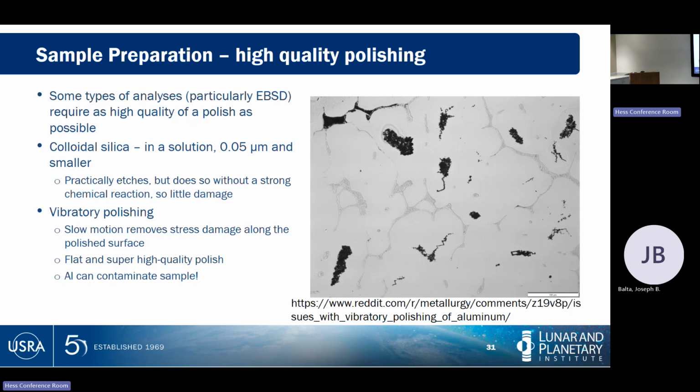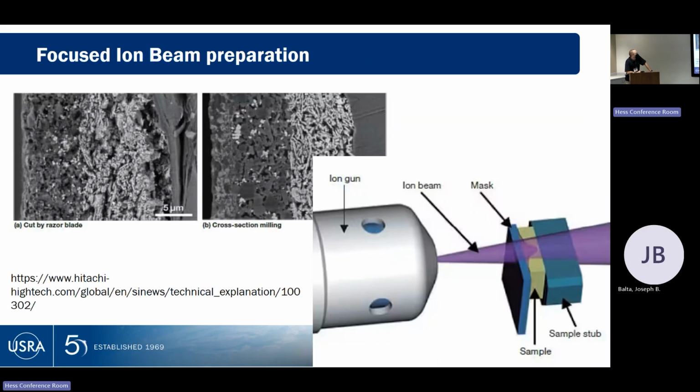It's nice, it's super high quality, but it's also super fine stuff. If you're immersing this sample in superfine silica or superfine aluminum, you're going to get some superfine silica or superfine aluminum in your sample. I have run into this before where it has affected some analyses I've wanted to do.